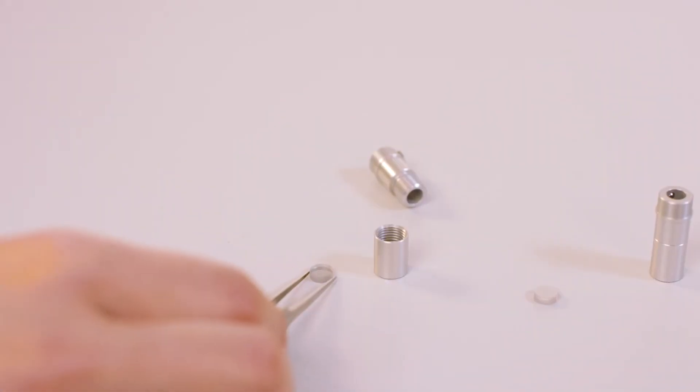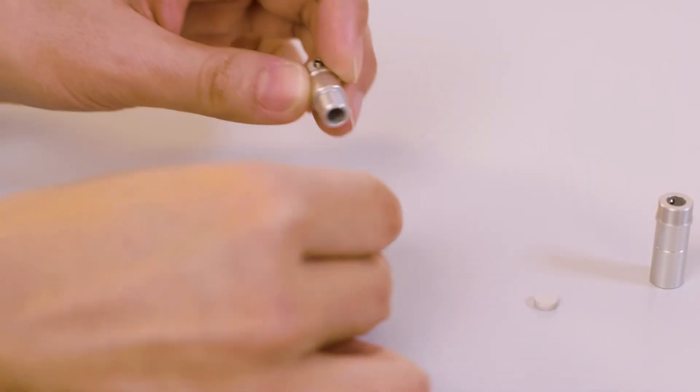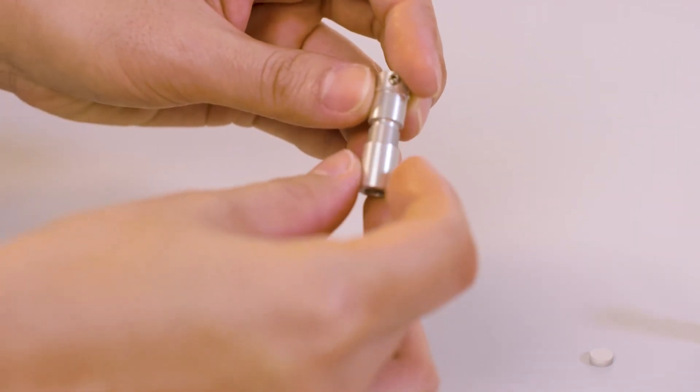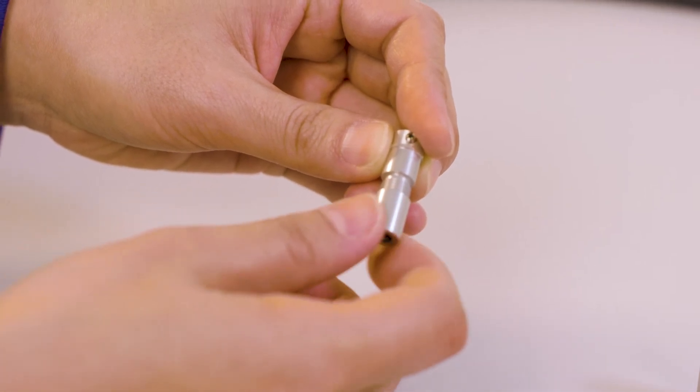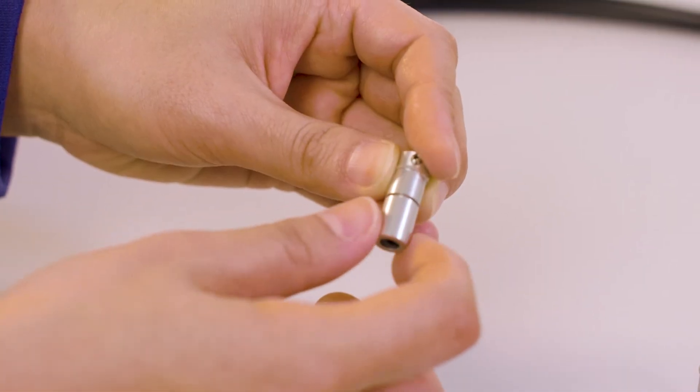Insert any desired filters by unscrewing the holder end cap. Make sure that the filters slide flat in the holder before screwing the cap back on. The filter holders must be in place even if no filters are required.